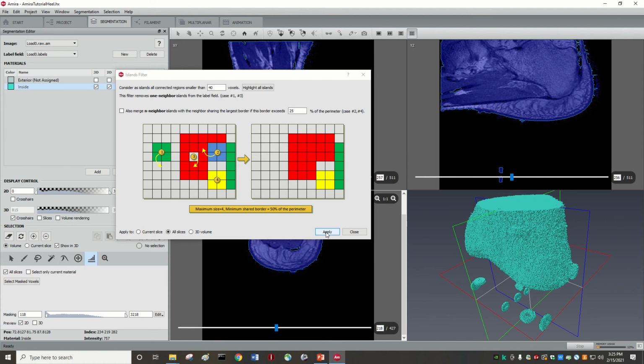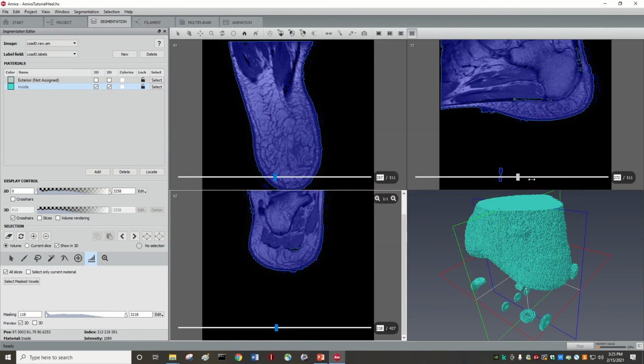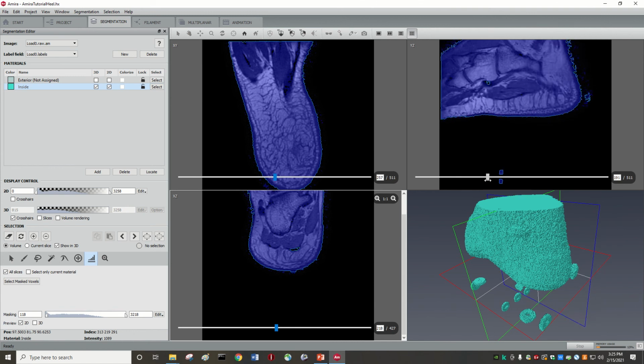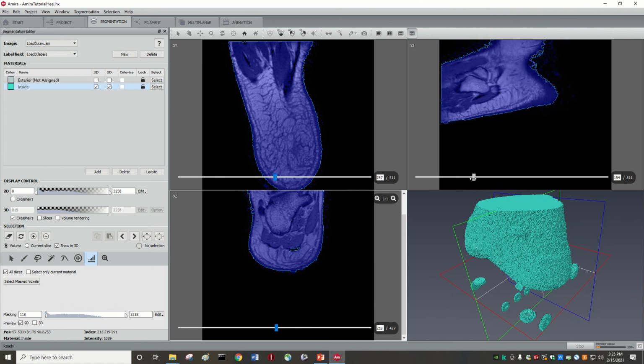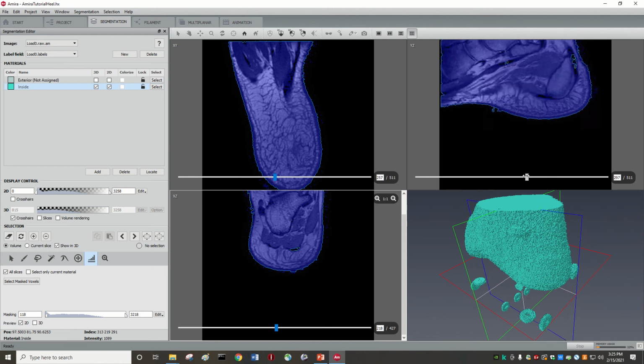And then finally also for this one. Okay, nice. It's already much nicer right now. Okay, so now we have some still bigger holes inside that we could fix. Actually, these ones can be fixed with the volume.